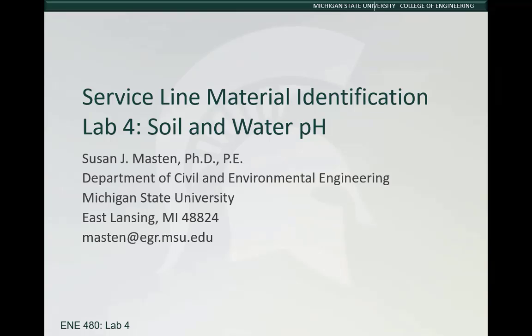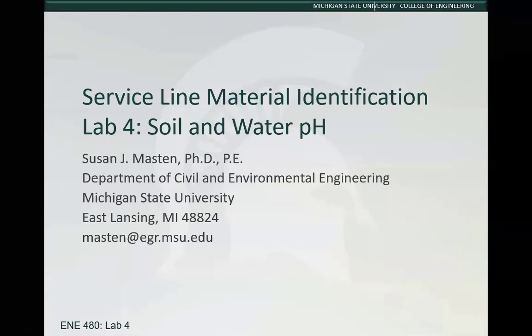So in this lab, we're going to look at the issue of service line material identification. And with that, you will monitor or determine soil and water pH, and with that also determine soil type.